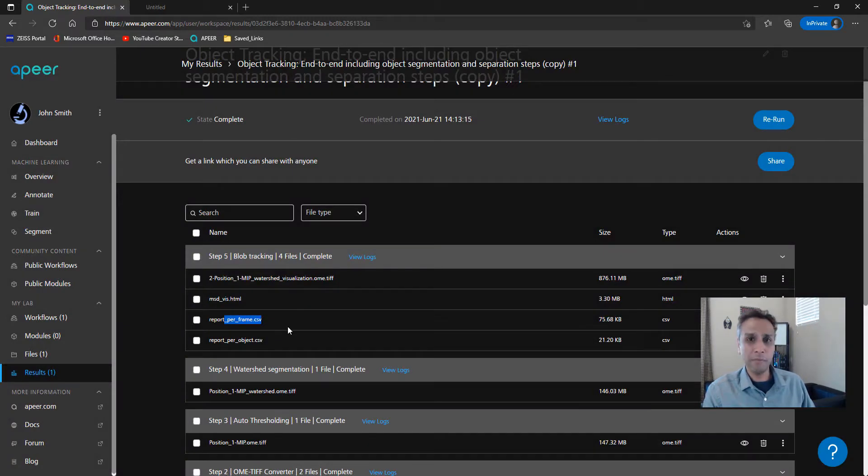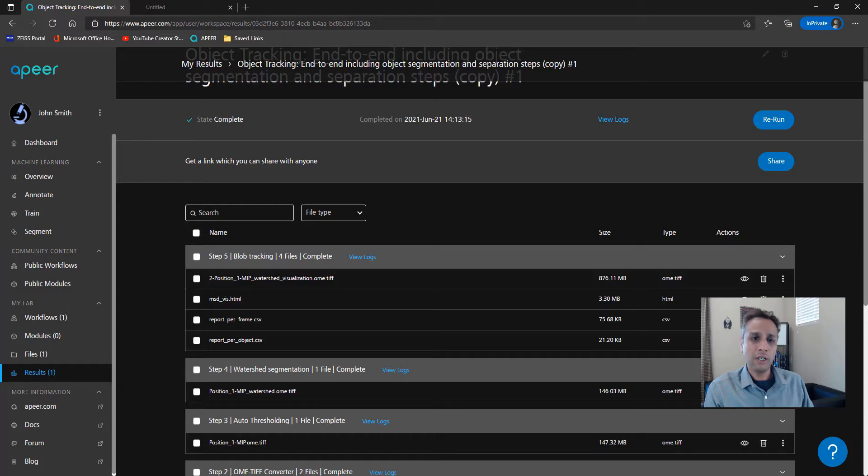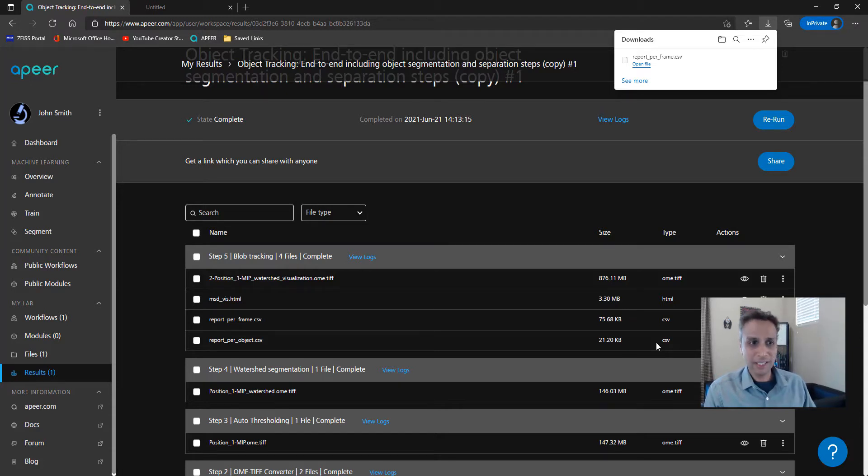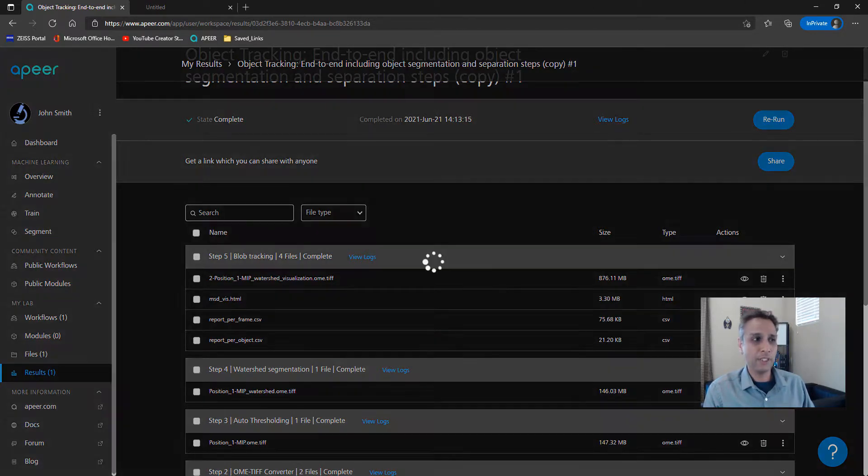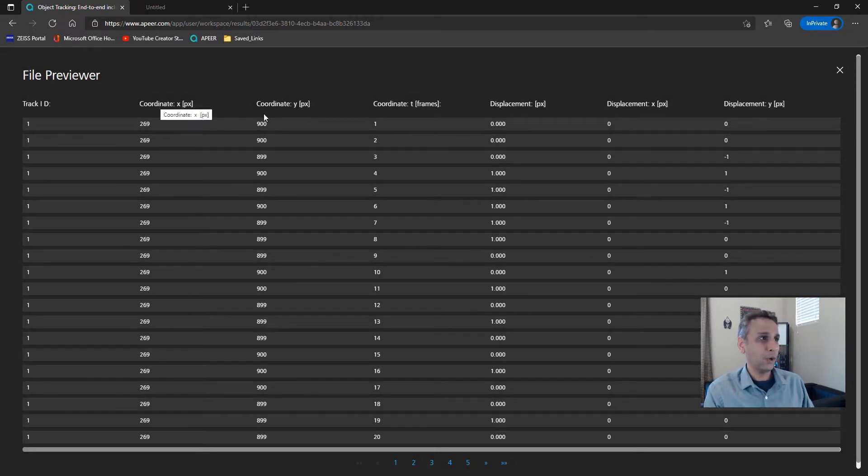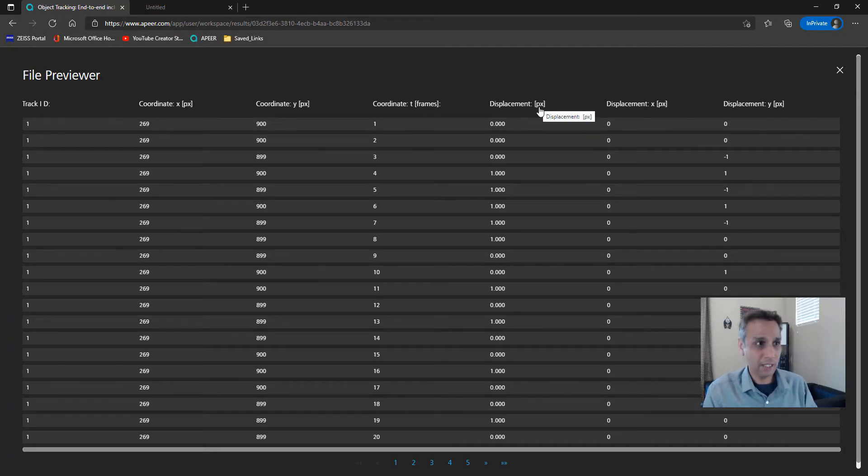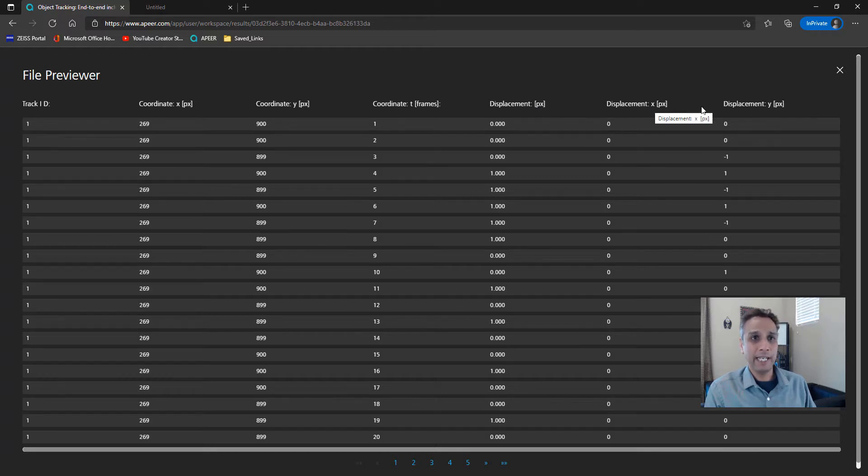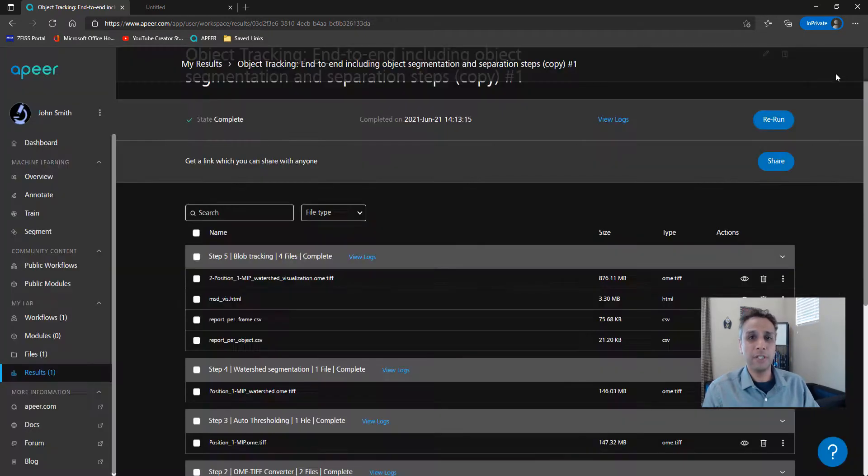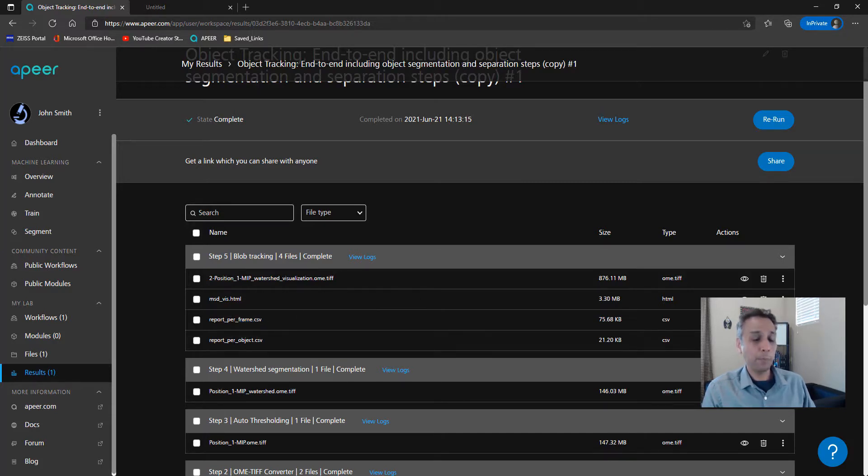Let's download the HTML file. What else do we have? We have report per frame. This is a time series, so you have a report per frame and a report per object. You can visualize this right here in the browser or download these and open them in your local Excel. I don't have Excel on this system, so let's click on this eye button to have a quick look at what result we have. It has the tracking ID, coordinate of that specific object, the displacement in pixels, displacement X, displacement Y, the total displacement and so on. You can go through this. This is the information we're using to do this HTML plot.